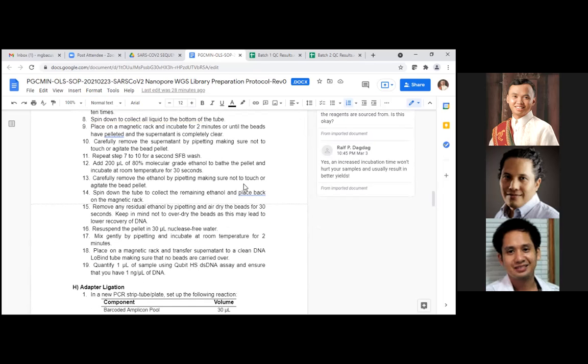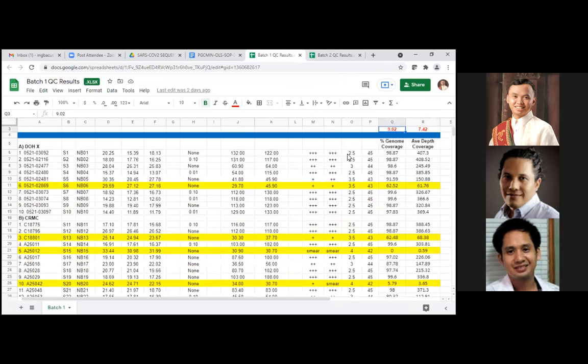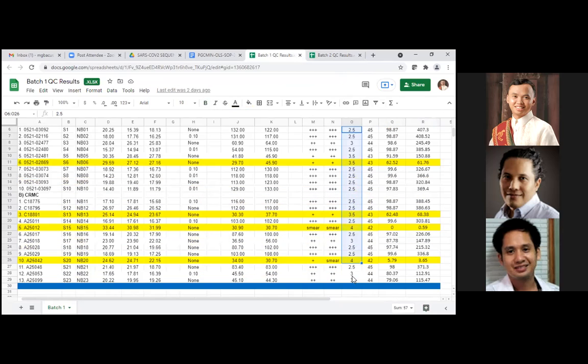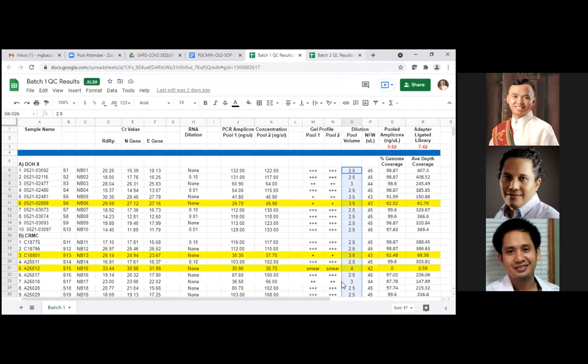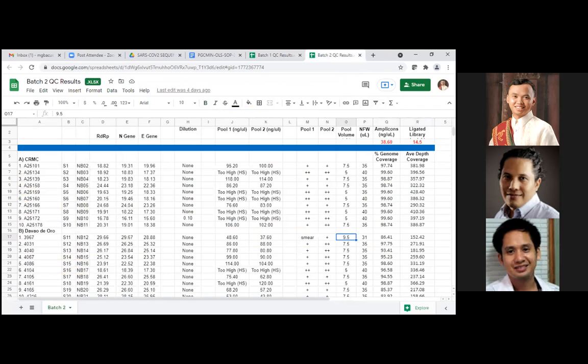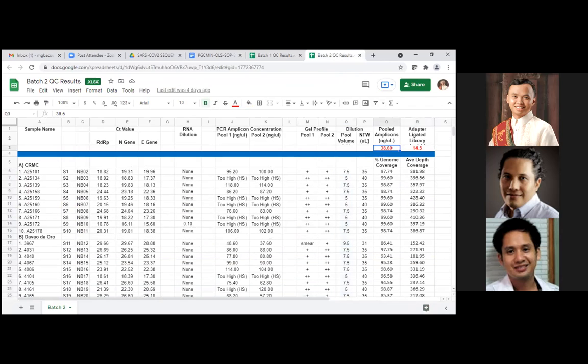So in our first sequencing run, we were able to have around 9.02 nanograms per µL of pooled amplicons, following this dilution process for 23 samples. But when we changed the dilution process, we had at least 38.6 nanograms of pooled amplicons. But we did not retain much after the cleanup.